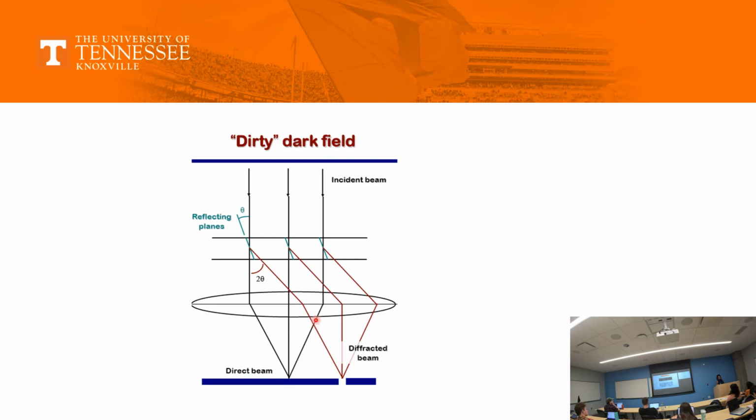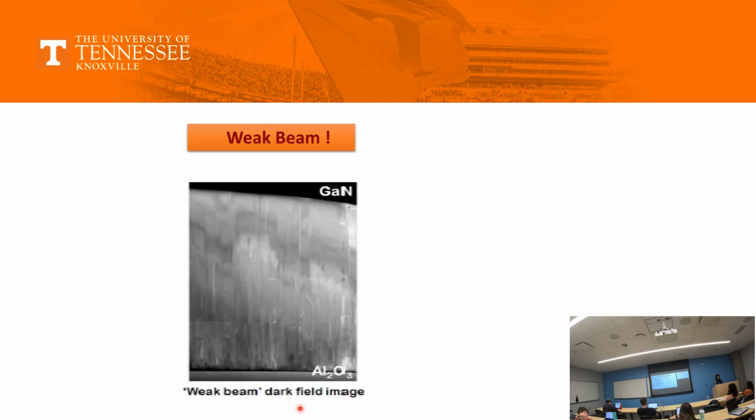Sometimes you see a ray diagram, and if a spot is in the center, it doesn't mean it is the bright field. You can change the positions by tilting. You constantly tilt your spots and bring them to the center for your convenience, because the camera is just underneath. The camera is generally aligned to the center of the screen. That's why we bring everything to the center.